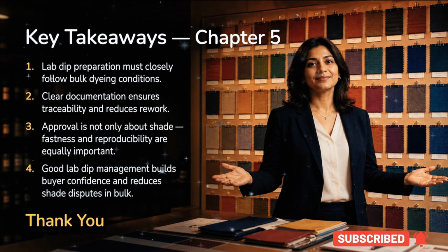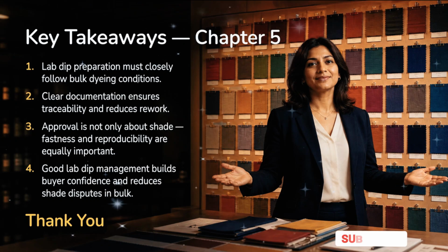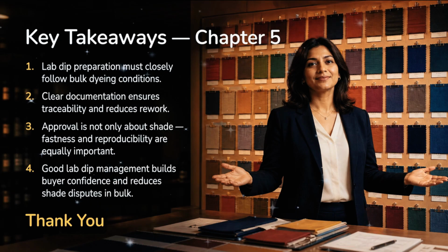Key takeaways from Chapter 5 are: LabDip preparation must closely follow bulk conditions. Clear documentation ensures traceability. Approval involves not just shade, but also fastness and reproducibility. Good management builds buyer confidence and reduces disputes.